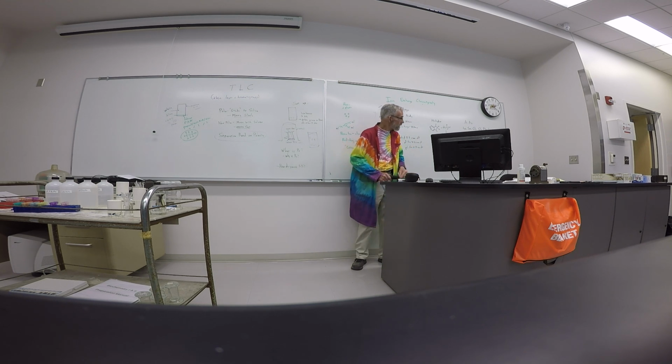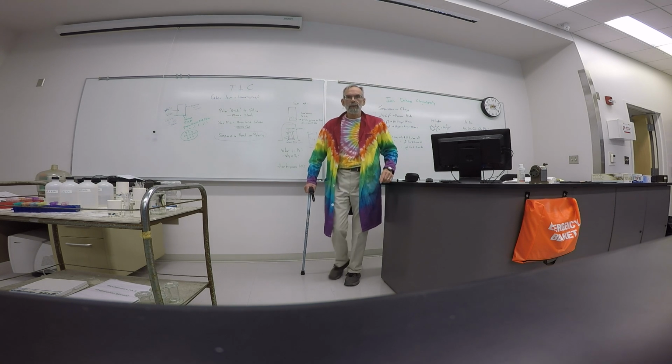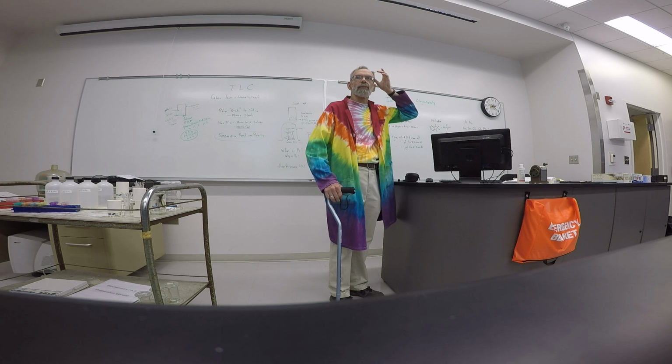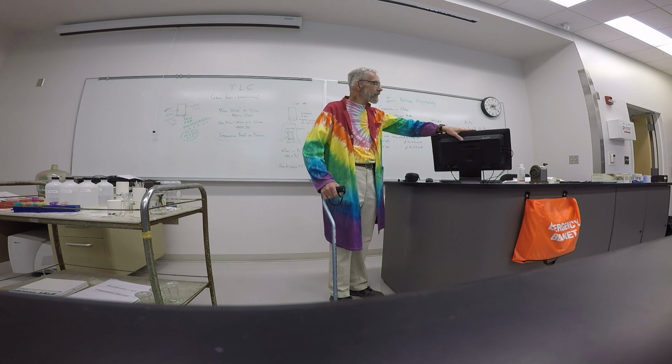Now, this reacts with any free amino acid. Okay, the first question that I have for you is on your first question for today. Will the reaction with BSA be the same or different than the reaction with the amino acid?